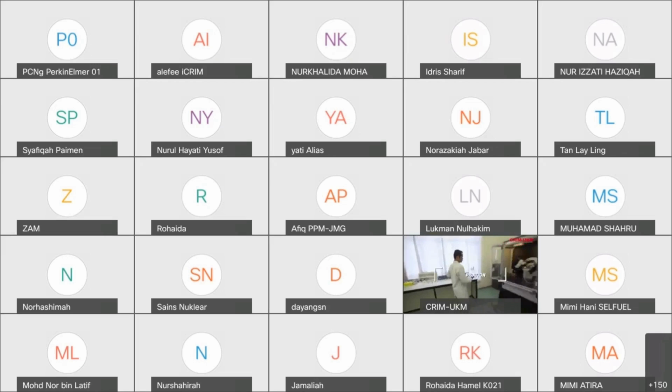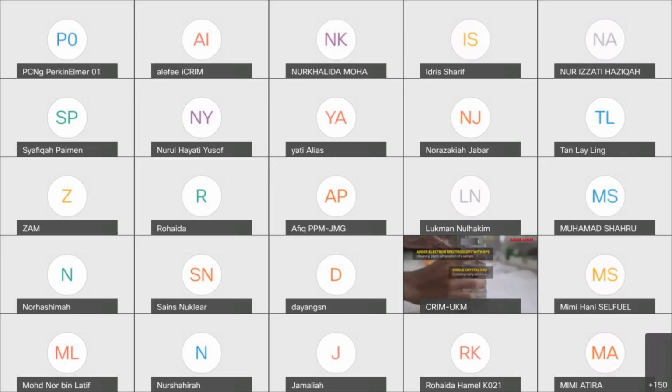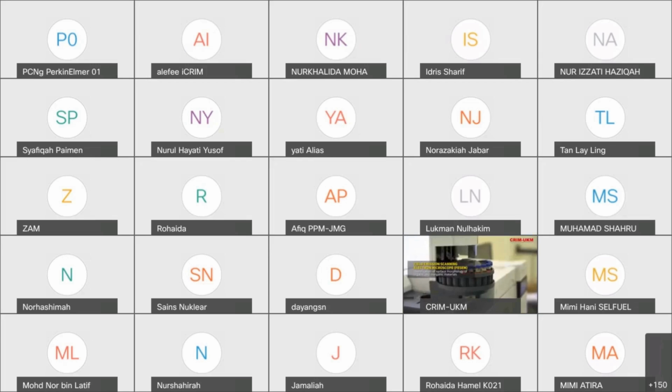Physical Characterization Lab is equipped with Auger electron spectroscopy with XPS, single crystal XRD, X-ray fluorescence, X-ray diffractometer, photoluminescence, surface profiler, ultraviolet VIS. Morphology Lab is equipped with field emission scanning electron microscope (FESEM), particle size analyzer, scanning probe microscope, atomic force microscope.